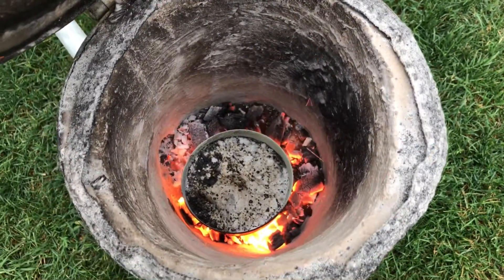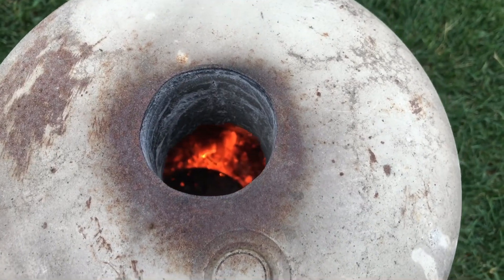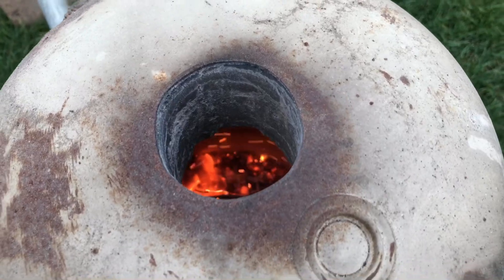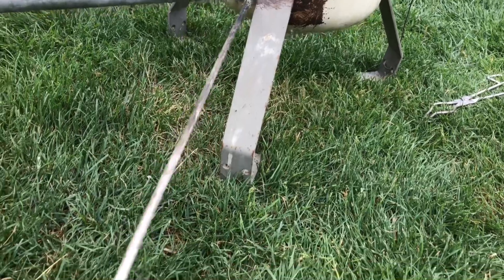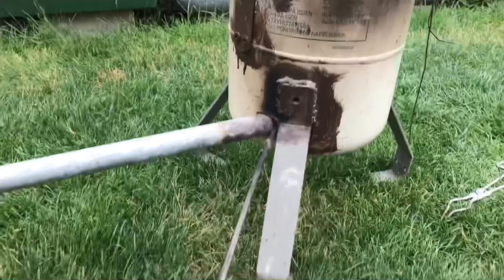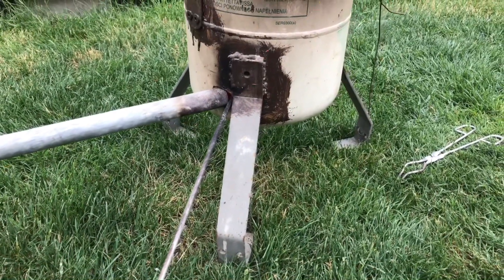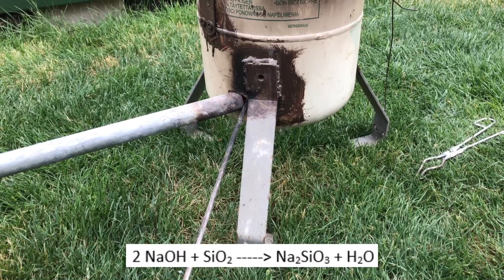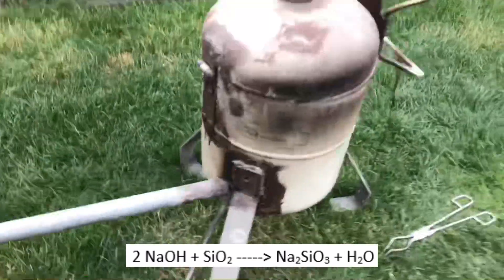Here you can see how hot it actually gets. We let it react for about 10 minutes before taking it out. It is very hot in the furnace, but not hot enough to make the reaction even more efficient, so we blew in some propane to get it even hotter. Do you see all of those sparks flying out? This is because we introduced the propane, which leads to a very small explosion in the beginning. The reaction should be the following: sodium hydroxide reacts with silicon dioxide to form disodium silicate and water.